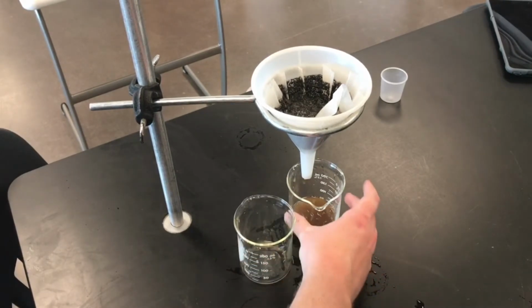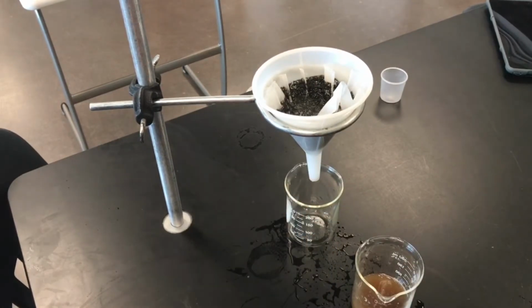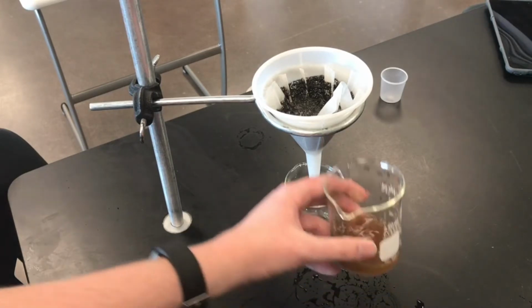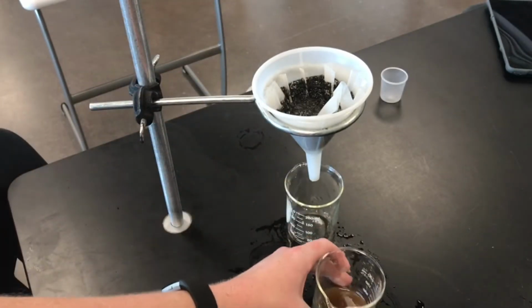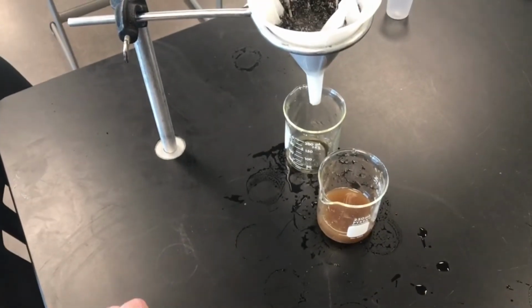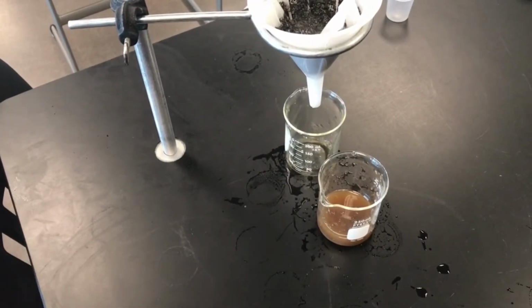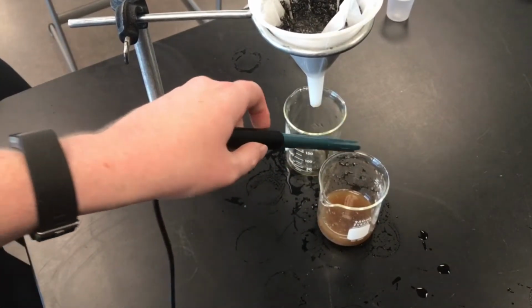I'm just gonna take my soil B sample here, place something under it so that nothing spills out onto the table. Nice, nice soil B sample here. So what I'm gonna do, after I've rinsed off my pH probe, which I've already done here, rinse off your pH probe before you stick it into your acid solution.